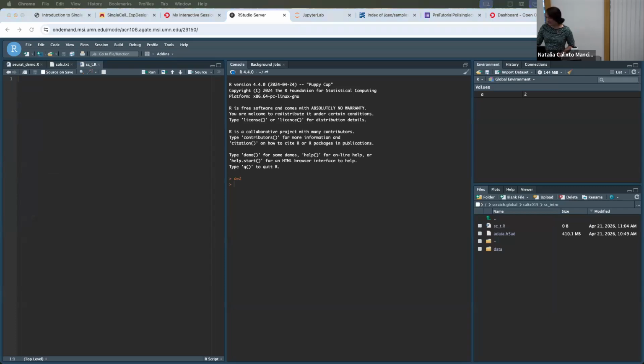For this part, as I told you, you will need to install the packages. And the way that R knows where to look for packages is because it has a variable that's called libpaths. So if you see what's in this variable, you see where R is going to look for packages.